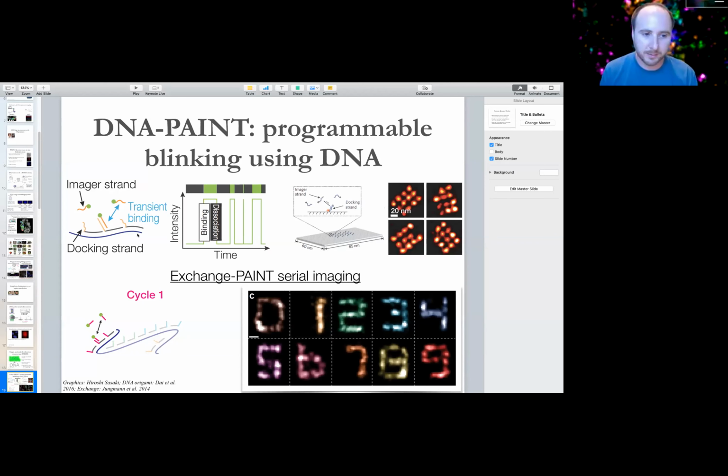So this blue here is our genomic target we're trying to hybridize to. Let's say this is a messenger RNA, and here are our complementary DNA FISH probes. What we do is we put a short overhang of sequence onto each probe that's shared for the probe set. And these are typically 9 or 10 bases long. And we do the imaging in the presence of the complementary sequence that has a fluorophore label. So just by random collisions, you'll get transient hybridization and binding of the fluorescent oligo onto these sites.